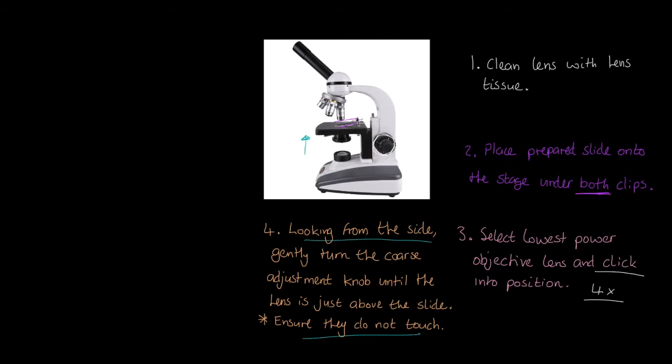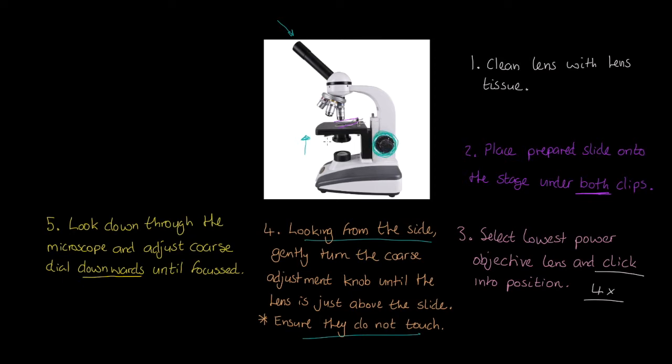Next in our process, number five, look down now through the eyepiece and adjust the course dial downwards until focus. So now what we're doing is we're using the course adjustment knob, and we're bringing the stage down until we get a focused image. It's important that we adjust downwards in this stage.